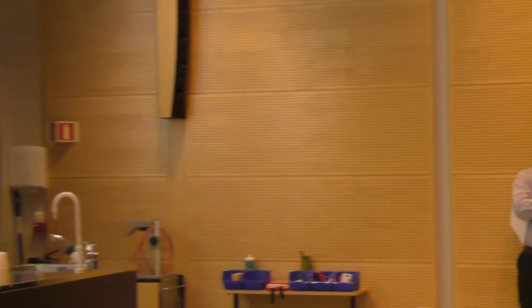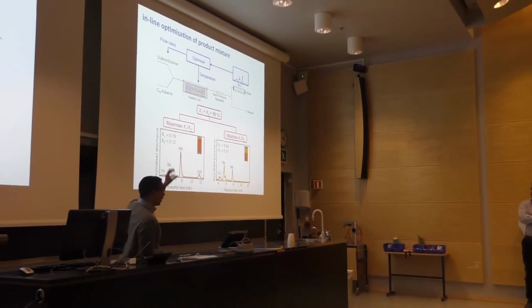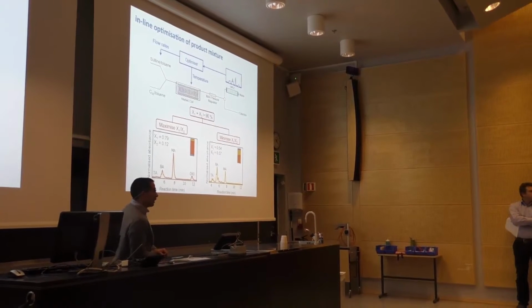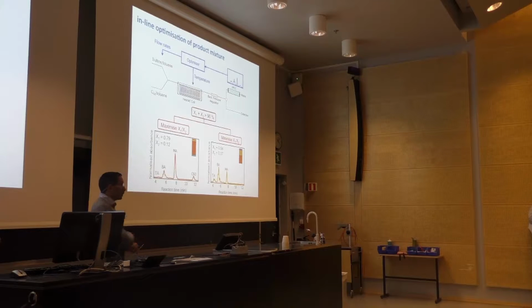Within that reactor is something rather crucial to making this work, which is the back pressure regulator. We work at, James, you'll probably remember, 5 bar, is it? We typically work at 5 bar in order to prevent those two processes. And it works quite well, under pressure. But it's low tech. It's literally a spring-loaded valve.